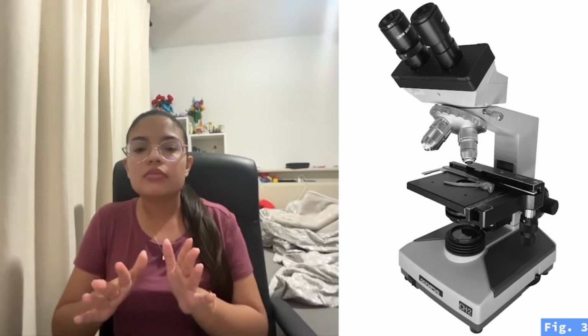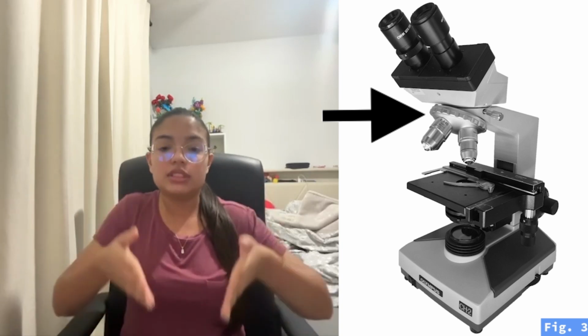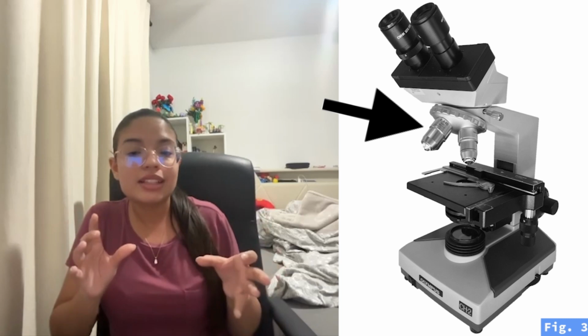And top down, it has some key parts, including the eyepieces, which actually let you adjust it so you can see the specimen. Then you have the nose piece that is directly underneath that and is connected to the objective lenses and rotates them so you can put them in the line of sight and actually use them to see the specimen. Then your objective lenses that, as I said, do the actual magnification, and you can change the magnification so you can see this specimen at the setting that you need.